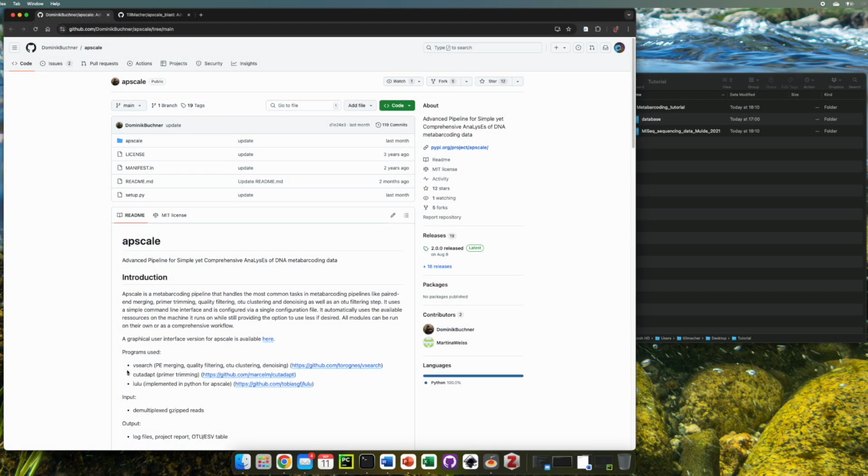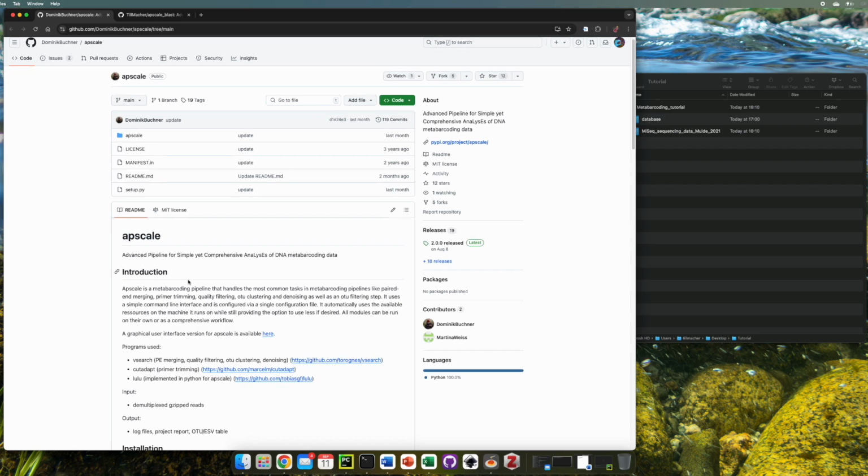Yeah, hello and welcome to the next part of this tutorial. So today we want to look at Apscale and how to process a metabarcoding sequencing run.